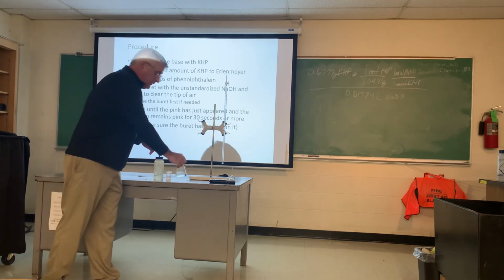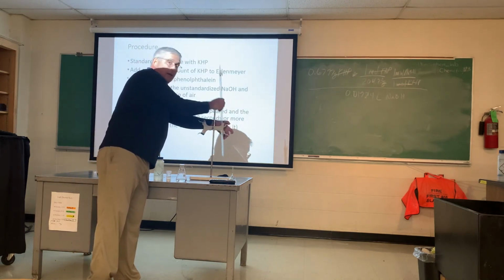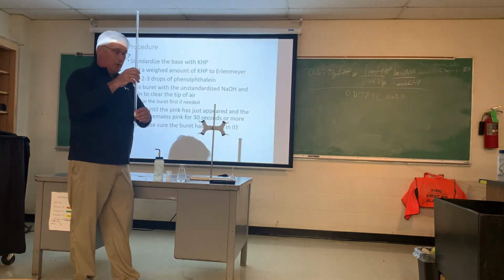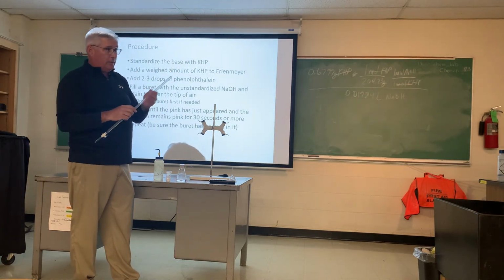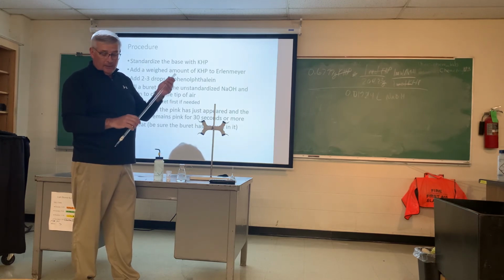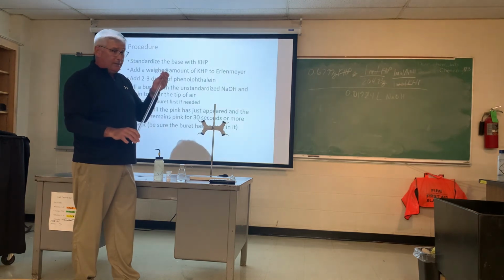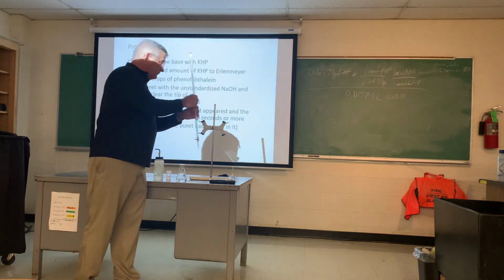Now, there's other things I want to talk about with titration. Number one, when you get done, always store your burette tip up. When you get ready to use it, turn it over, and you're going to rinse it first with your sodium hydroxide solution, okay? And you're going to then drain the tip and make sure that there's no air in the tip so that your first delivery is an accurate volume delivery.